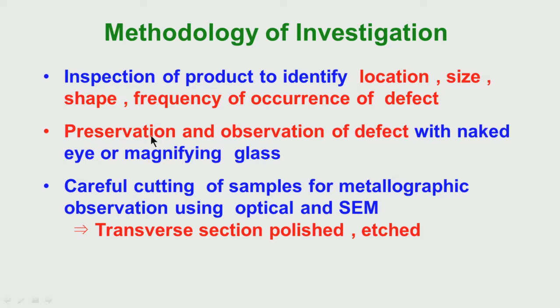In the process of cutting a sample for analysis of the defect, we should not create a situation where the defect is destroyed. That is why we say preservation, the defect should be properly preserved, and we have to be careful when we prepare samples. And then observation of the defect, with the normal eye and with a magnifying glass, because sometimes the defect may be so small that it requires some magnifying glass.